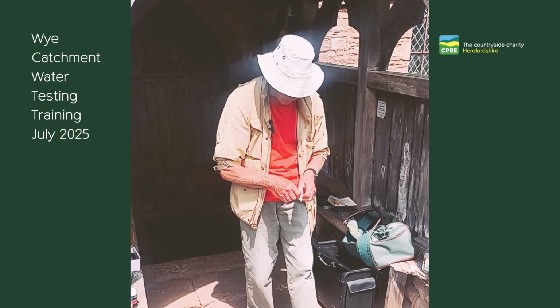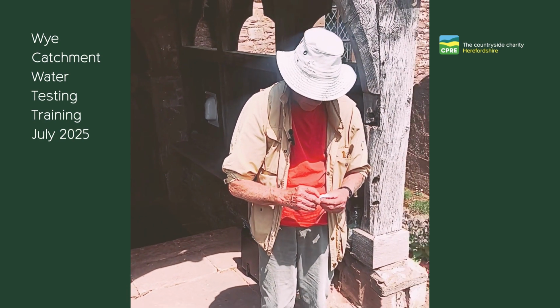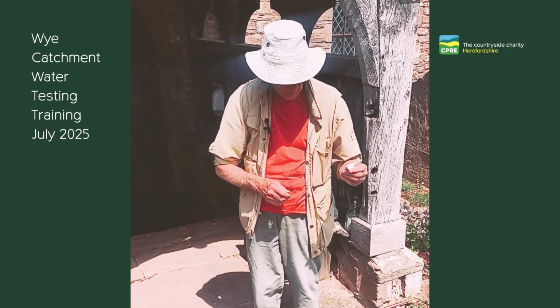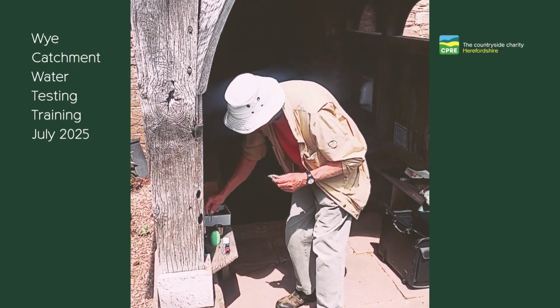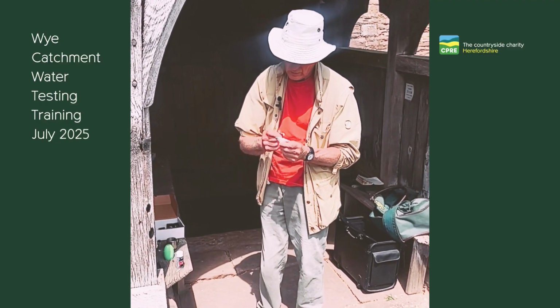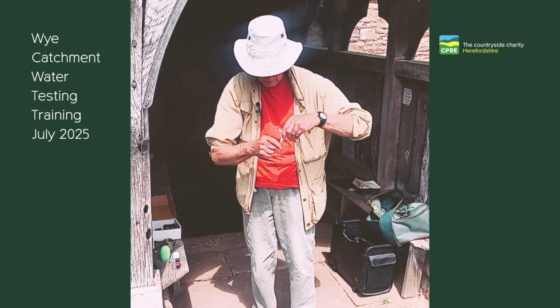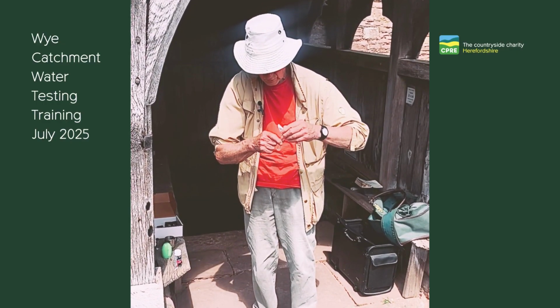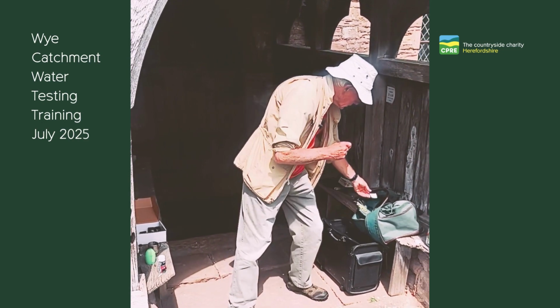So now we have to form this sachet into a funnel, which is done like so, which enables us to pour the reagent into one of the cuvettes. So this is the cuvette, and I'm now pouring the reagent in. Make sure it's all come out. Yes, it has. So I can throw that away.